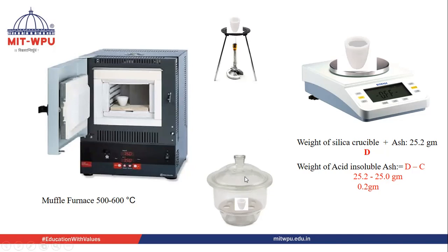And after cooling it, we will weigh it. We will note the weight. So weight of silica crucible plus ash is suppose 25.2 gram. We have washed the total ash with the acid. So some ash might be soluble in acid, and which will go away, and whatever insoluble was there, it is left on the surface of Whatman filter paper. So now the weight is 25.2 gram. I will label it as D.